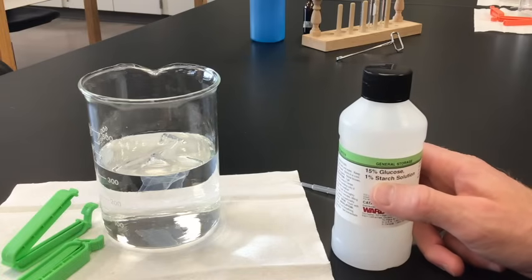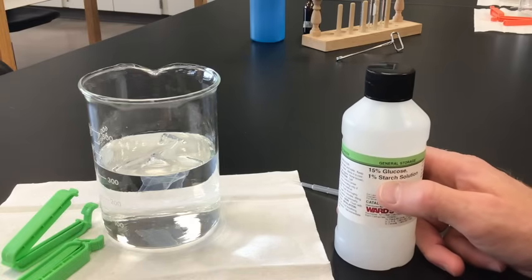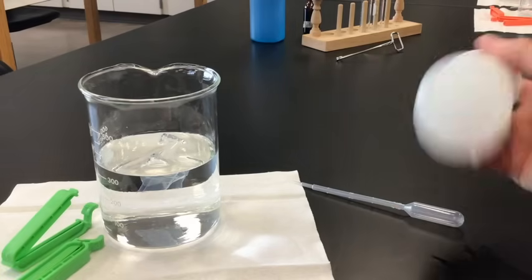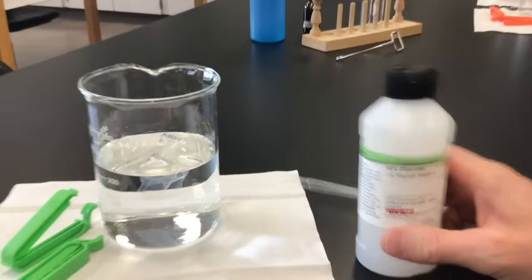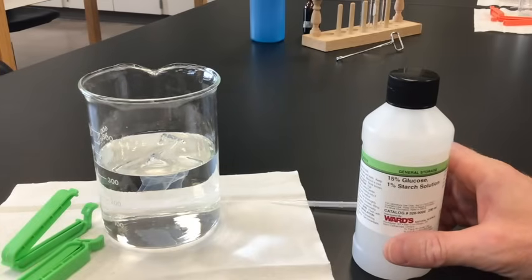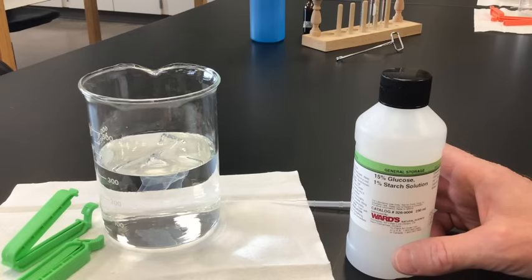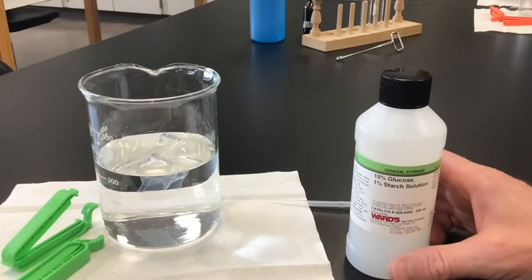And starch is made up of many, many glucose molecules stuck together as a polysaccharide. So this is just a combination of both of those two things mixed together. We're going to see how this moves through a membrane — in this case, dialysis tubing, which is made up of cellulose.